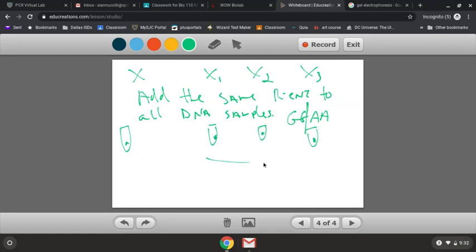We're hoping that one of these three test tubes is cut the exact same way that this test tube is cut, because we want one of these individuals to match this one so we can know who the killer was. Now, again, it doesn't have to be any of these three in real life, but in our scenario, one of these three is going to be the killer. So one of these three test tubes has to match that one 100% exactly. So let's take a look at how we do that.